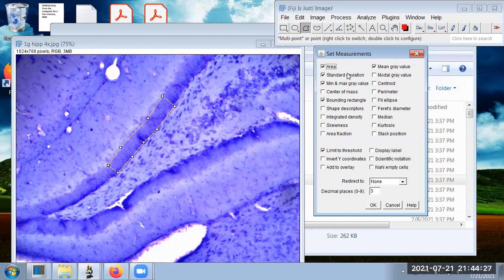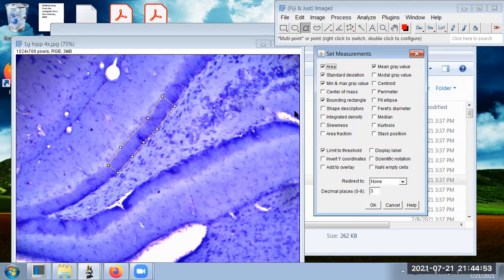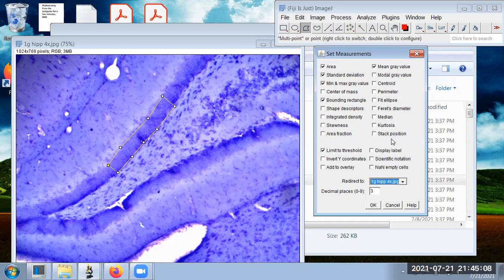We have some metrics to set: mean gray value, standard deviation, and min/max gray value — these are all for grayscale images. We won't see these so much in this multicolor image example, but they'll come up again when we talk about the fluorescence image. We want the measurements set to the bounding rectangle or selection, so it's focused on the selection and not the whole image. We can also redirect to a specific picture if we have multiple images open. We're going to unclick 'Limit to Threshold' and hit OK.